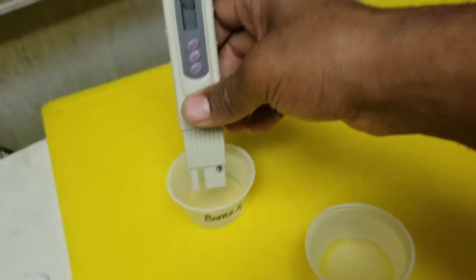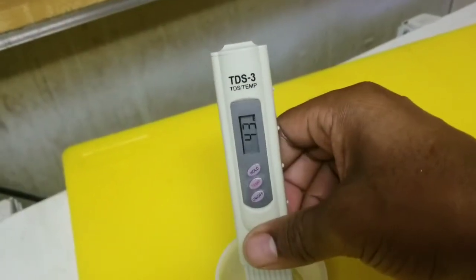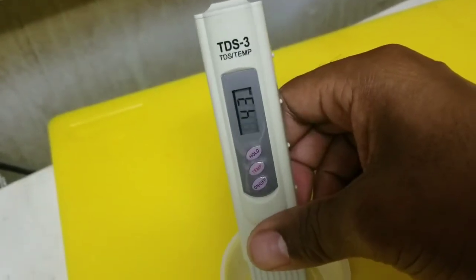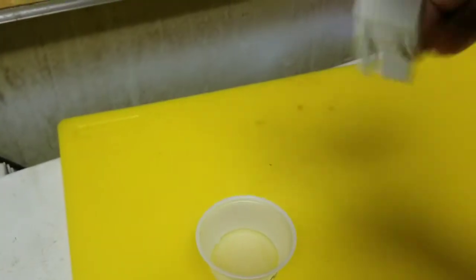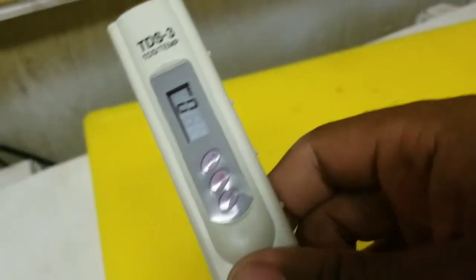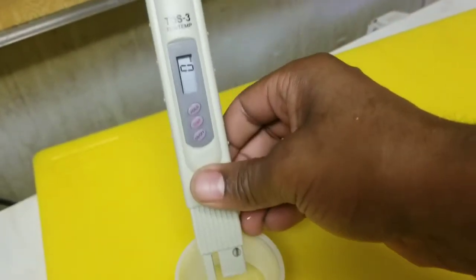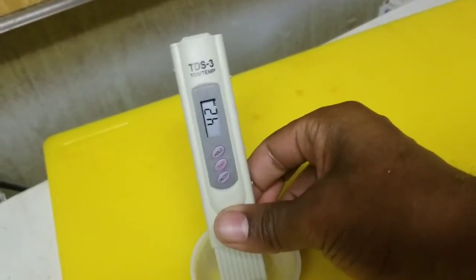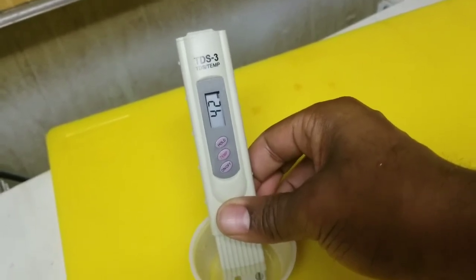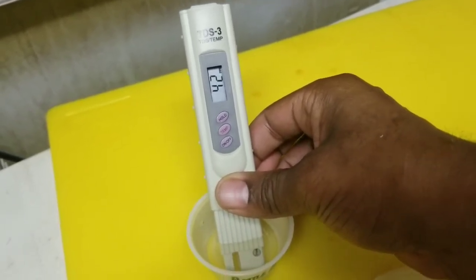Now this is the good stuff that we pay money for in the store. Whoa, 43. Hold on, that can't be right. I'm paying for water that's worse than what I'm getting out the tap. Let's start with 0. Put it in here. 42. Okay, now we're going to talk about this.